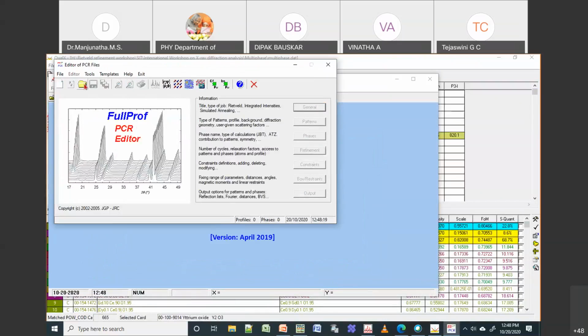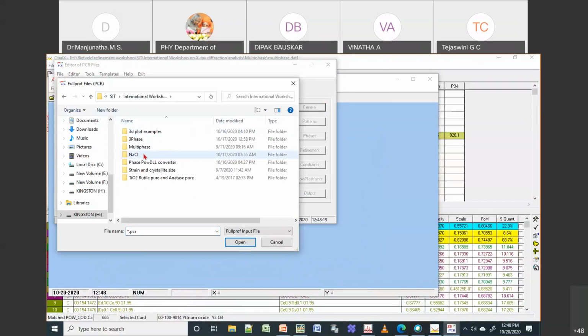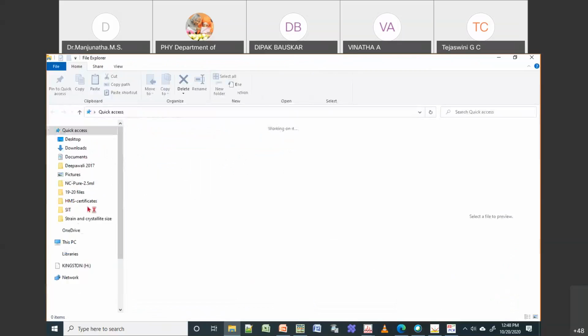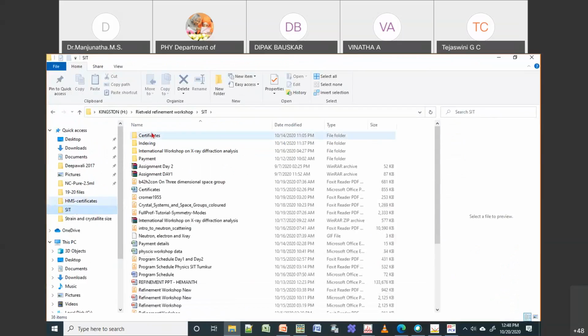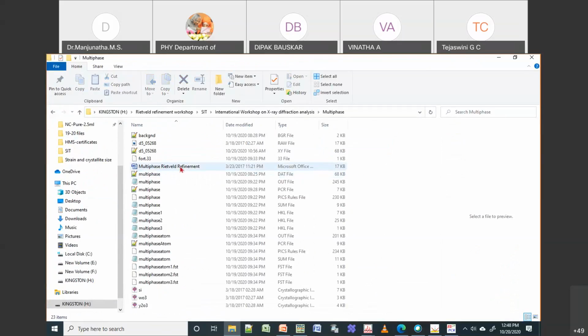I have sent this file. Along with that file, there are some other data files which already give you the information. If you open this, along with that there is a Word document which already gives what phases are present, or what possible elements are present.